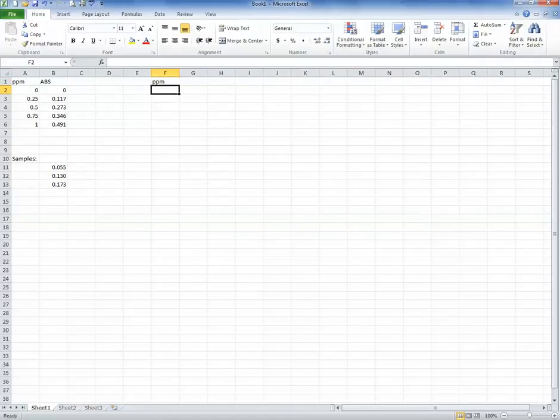That's the concentration that I'm typically working with, parts per million. I know that in a traditional chemistry course, they often tell you to calculate things in molarity. Molarity is the way to go. Moles per liter, moles per liter. What is the molarity? That's great. But that's not really used in industry quite often, and it's not really used in our program either.